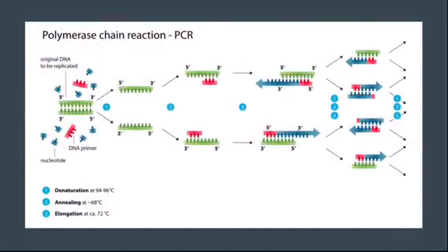In this image, the first stage is denaturization, where when heat is applied, the DNA unwinds into two new strands. Then, as the temperature cools off in the machine, the two primers of DNA, which are small segments that complement the separated strand, attach onto this DNA. This step is called annealing. Then, in the last step, an enzyme called TAQ polymerase acts like a glue and cements the primers and nucleotides, which are what make up the DNA sequence and make it unique, all together to form a new strand. This process can then be repeated many times to create as many copies as needed.